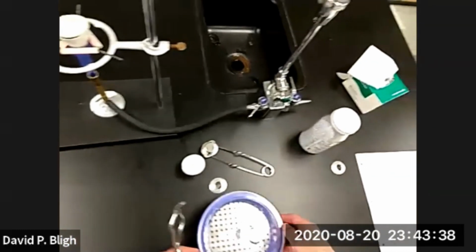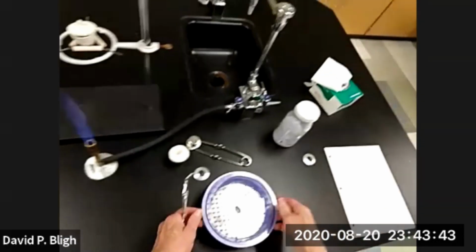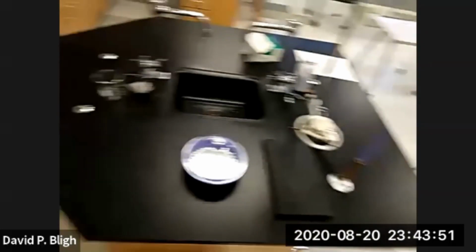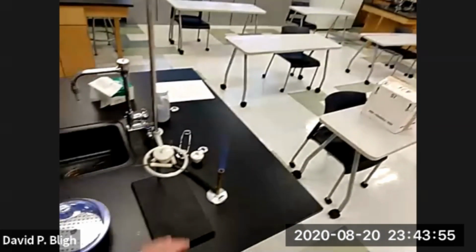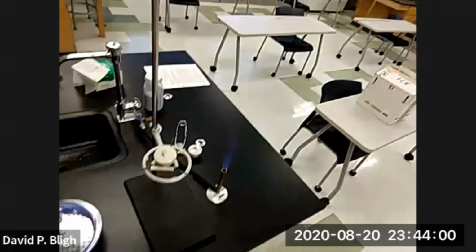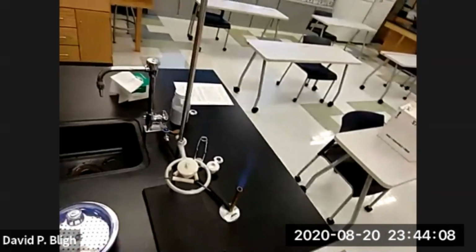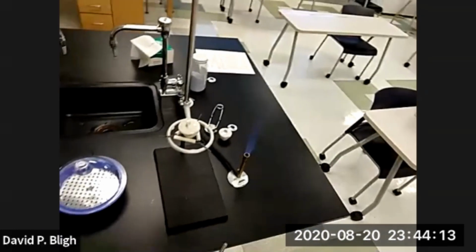And now we want to remove the heat. Let's get on this other side. Here we go. We're going to let that cool down a little bit before we put it in our desiccator. It's only going to condense water on the crucible when the temperature drops below 100 degrees centigrade, because that's when the water vapor becomes liquid water. So we've still got a few more degrees, so we can wait.